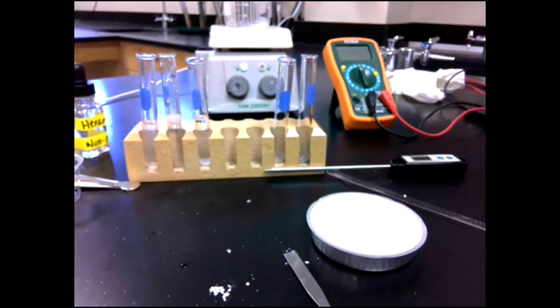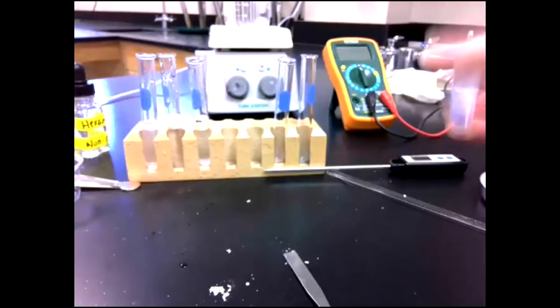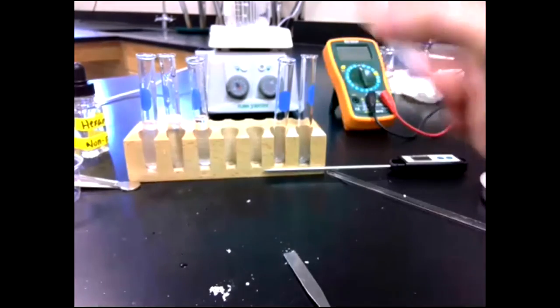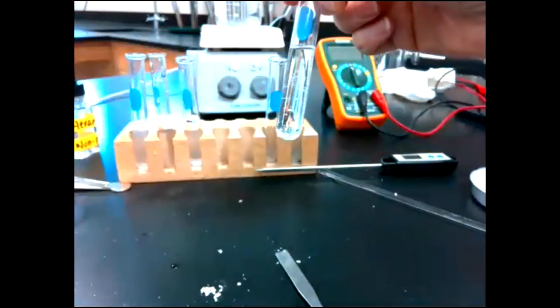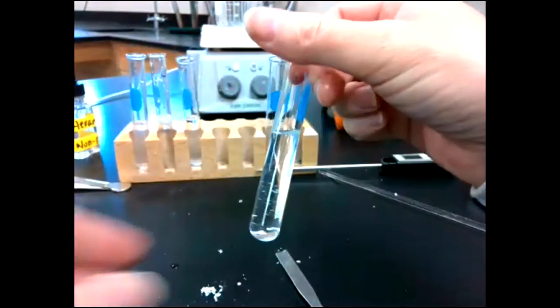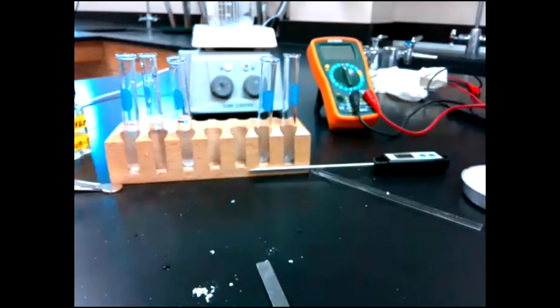I think I might have put too much in there. Yeah, it's definitely dissolving. Still not all the way there. Let me shake it a little bit more, and then I'm gonna wash my hands.